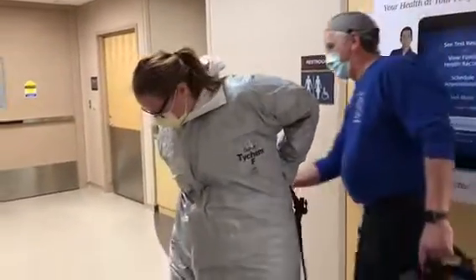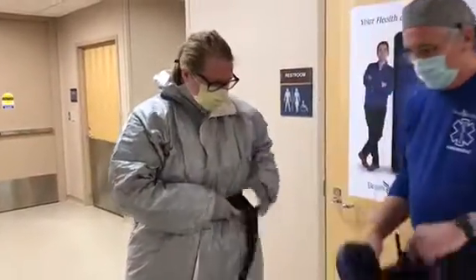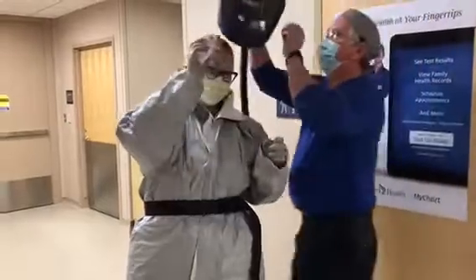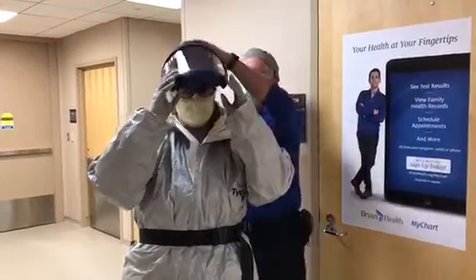So you put on your bunny suit, and you can either put the hood up over your head or have somebody tuck your hood in for you. And then you will put on your PAPR belt and PAPR hood.